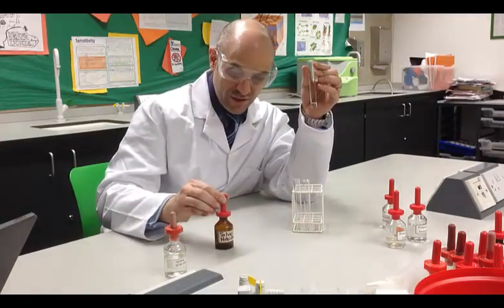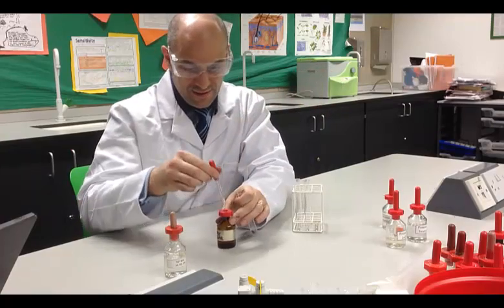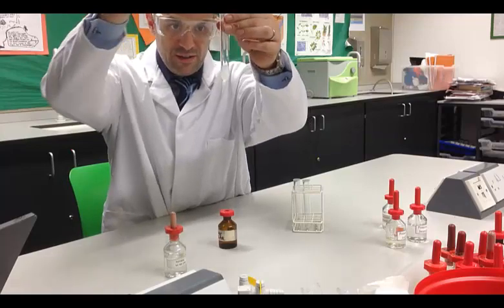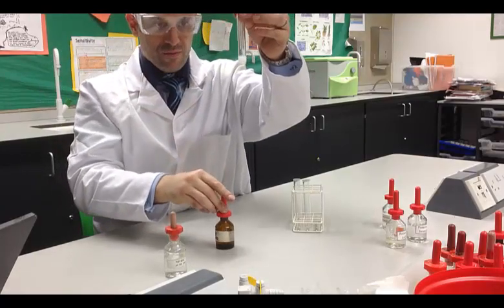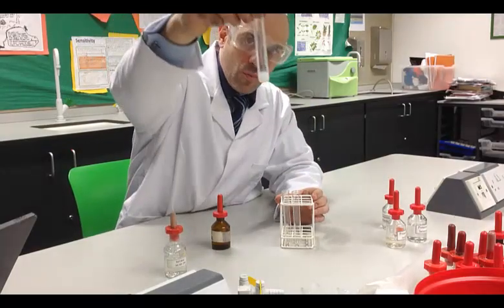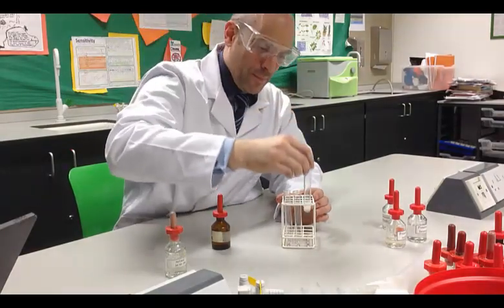Silver nitrate is our test reagent. We add this next. Okay, a few drops. And if you watch closely, you get a beautiful white precipitate form. Okay, so first I'm going to put this test tube here. A pure white precipitate. I hope you can see that.